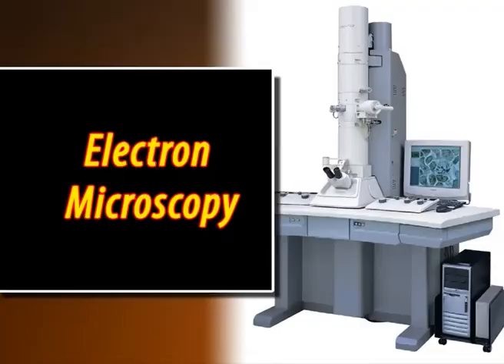In general, microscope optics are stagnant. To concentrate at diverse focal depths, the lens to sample distance is adjusted, and to receive a wider or a narrower field of view, a separate magnification objective lens should be applied. Most up-to-date research microscopes also have a separate set of optics for illuminating the sample.